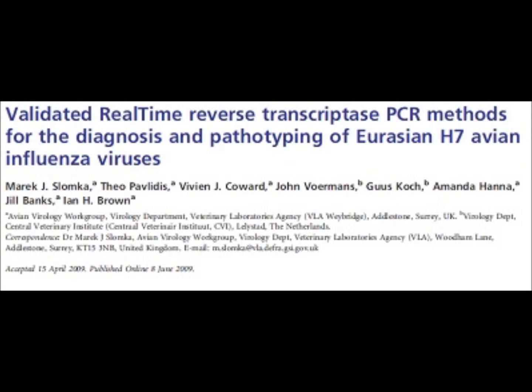Very good. Your research has particularly focused on a technology called lyophilization. Can you explain that in layman's terms for our audience of 79,000 food production, food quality, food safety, and food security managers? Yeah, so lyophilization is a process by which you essentially take the water out of the reaction.